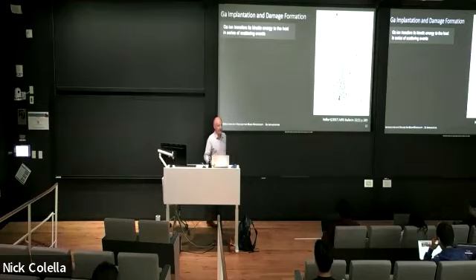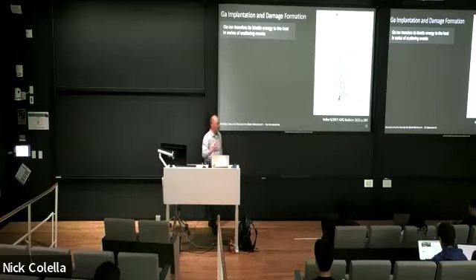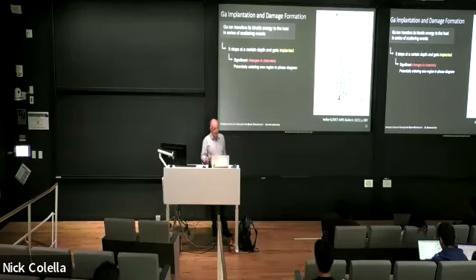So this is again, we're going back to the topic that I talked about at the beginning, right? That we have to be really careful about the gallium implantation and its effects. So what basically happens is that the gallium ions transfer their kinetic energy to the host in a series of scattering events. Eventually, it has given up all its energy and will be implanted at a certain depth.